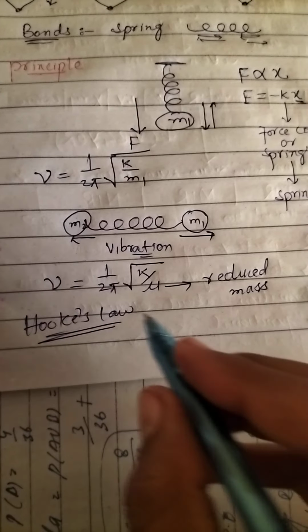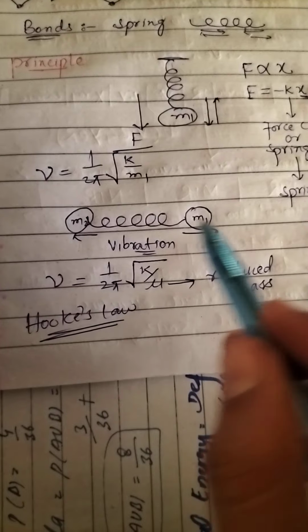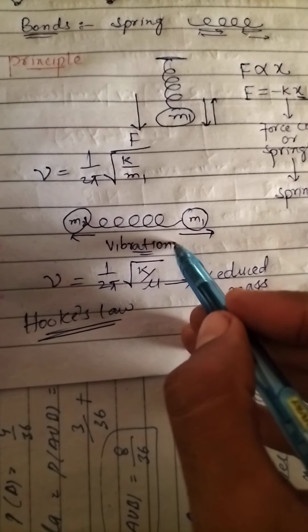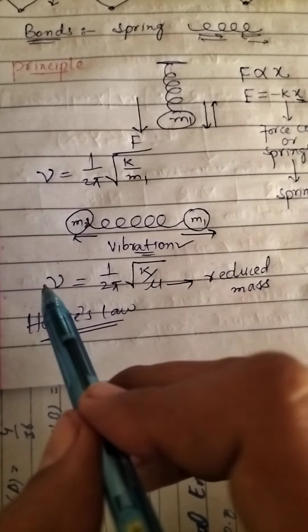we consider the bond as a spring through which the atoms move in different modes, in different vibrations, and the vibrations are directly proportional to the frequency.